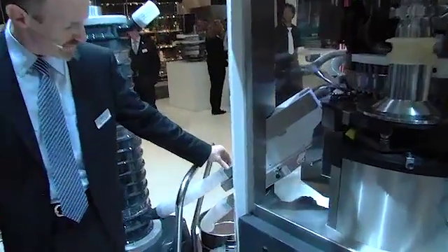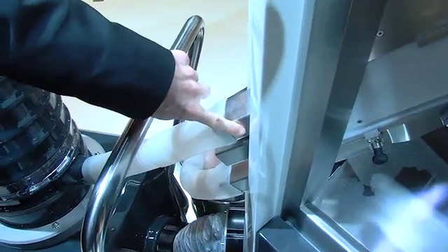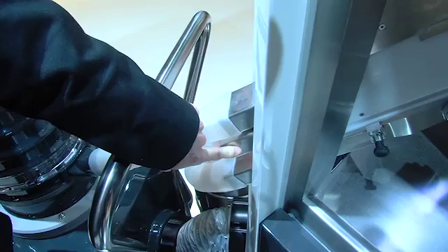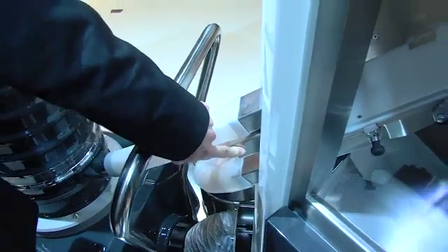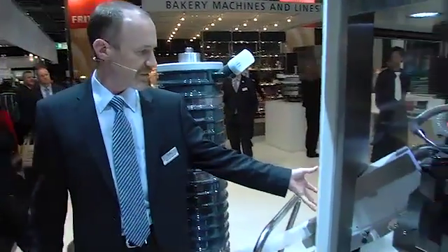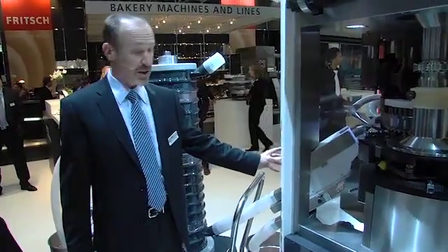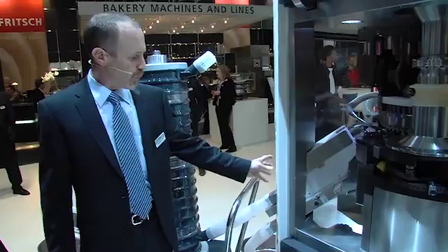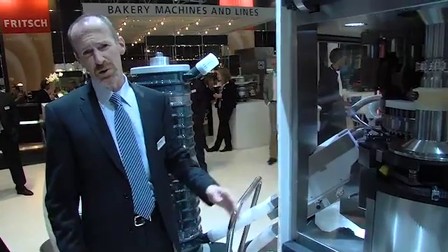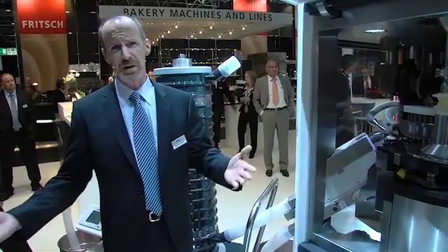You have all of the discharge units right here, and from top to bottom we would have good tablets, sample tablets in the case of tablets diverted to be measured for weight, thickness, and hardness, and rejected tablets. This unit is simple to install and uninstall. When the unit is reinstalled, there is no way for misaligning everything because the three different chutes are made up into one unit.